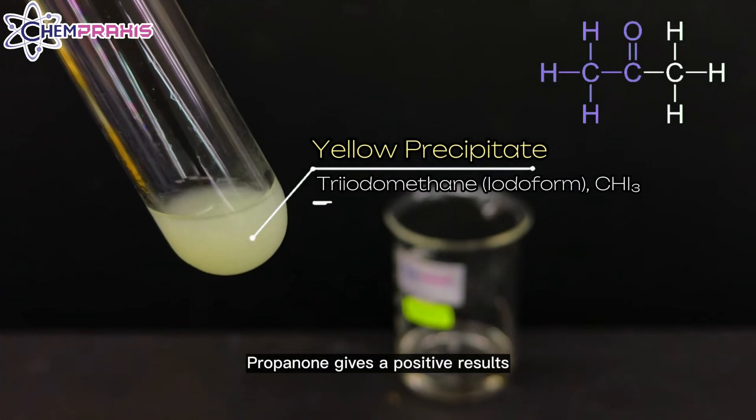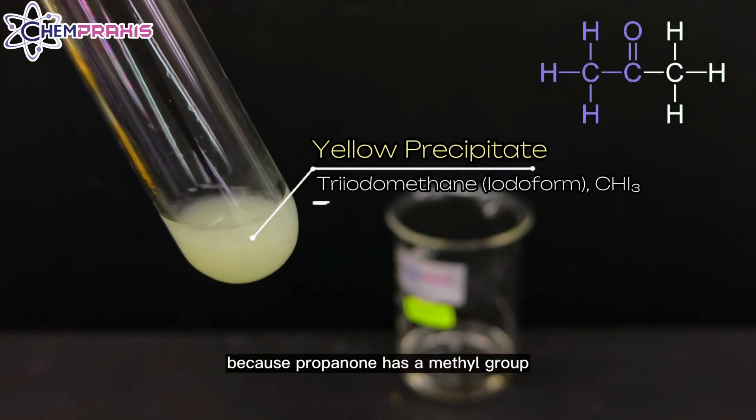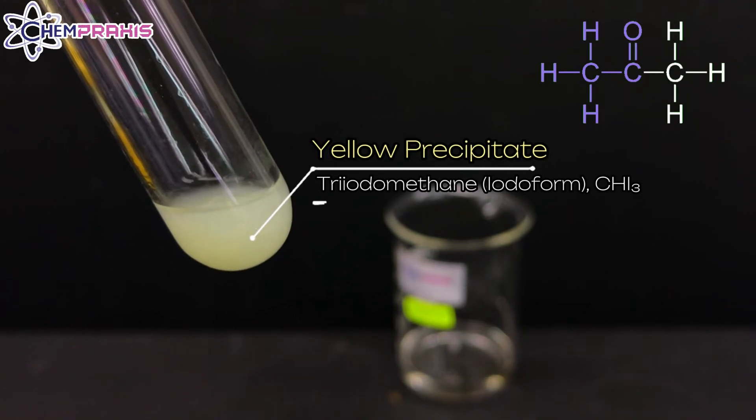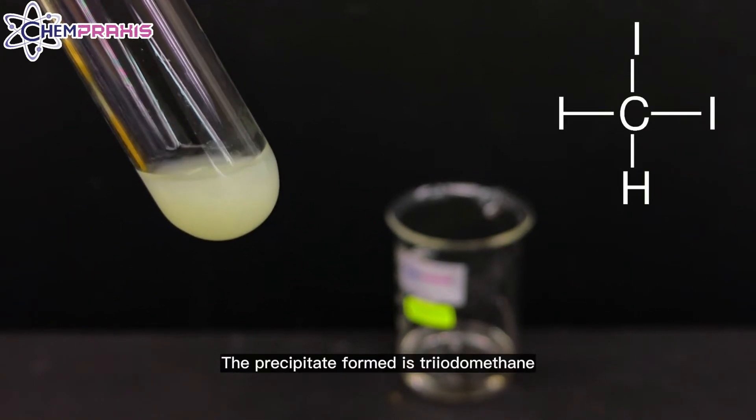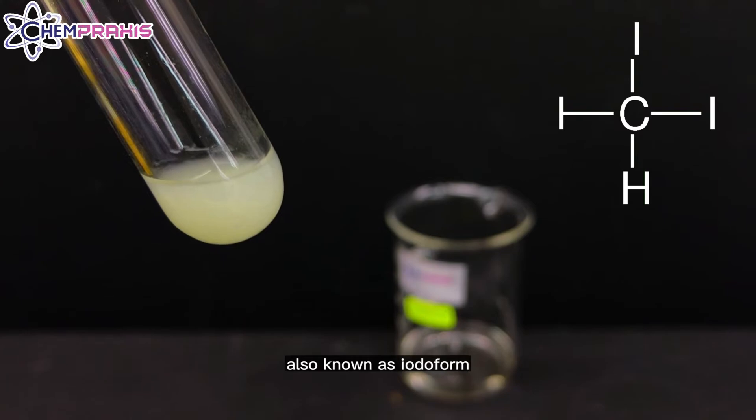Propanone gives a positive result because propanone has a methyl group next to a carbonyl group. The precipitate formed is triiodomethane, also known as iodoform.